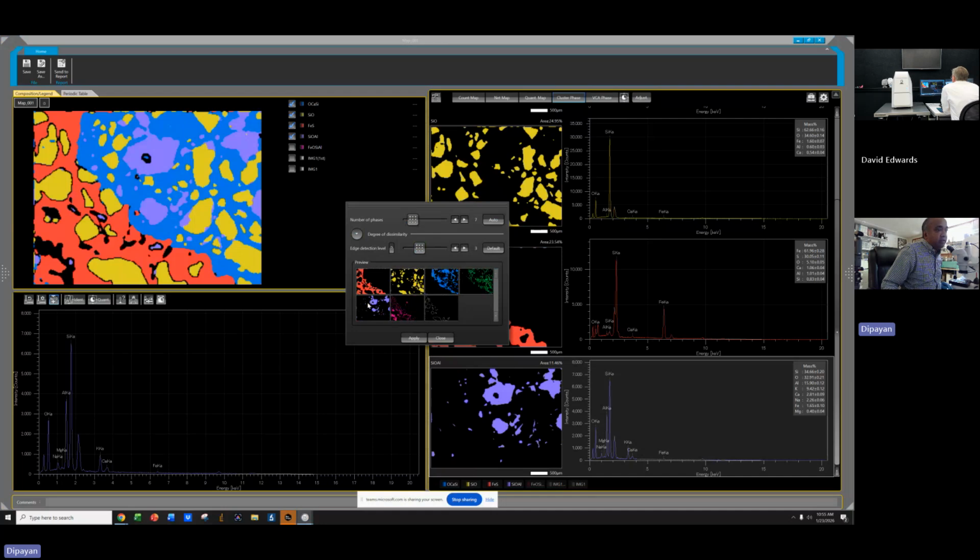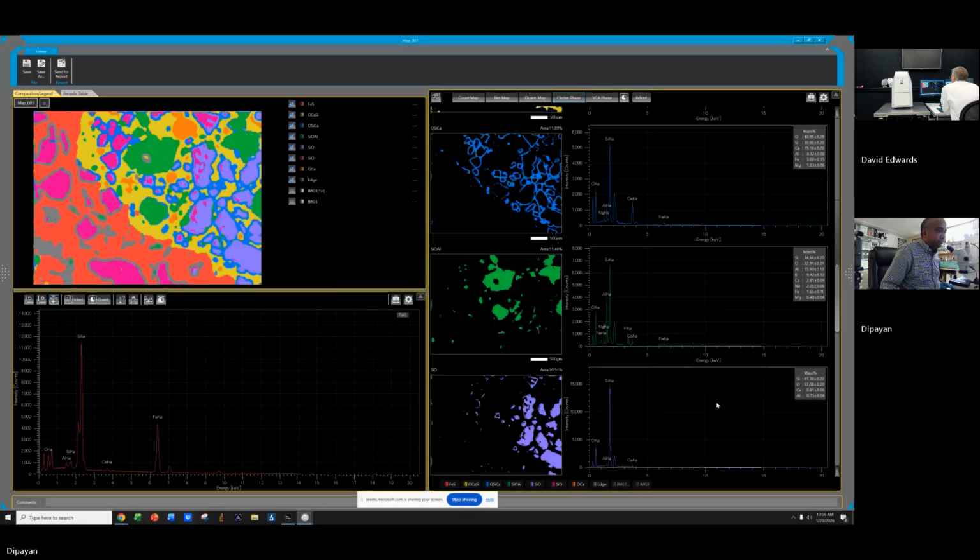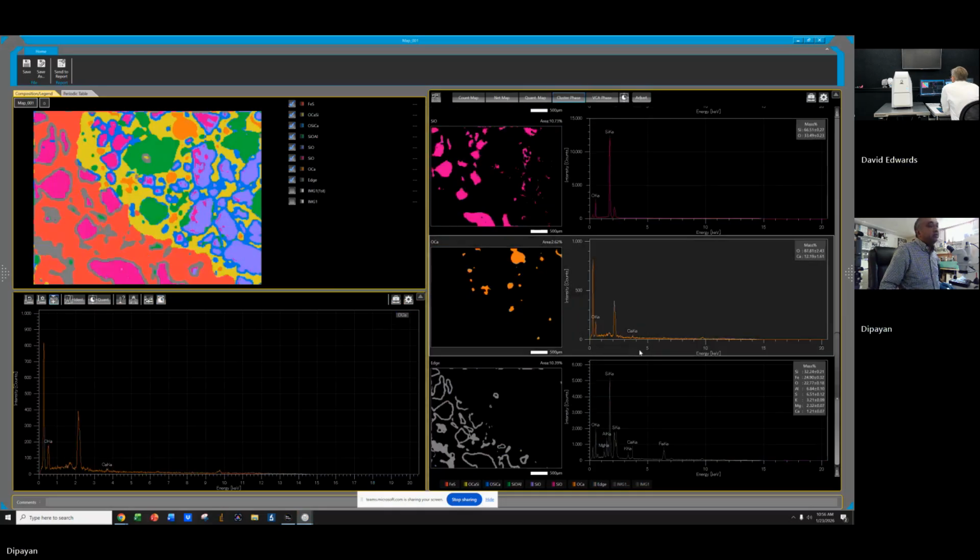But this one I can see, if I can split it, I would be able to see the splitting happening here. I don't need to apply until I see. Yep. Is it doing it? Like, for example, let's do this. It started creating some new phase. Yep. Right there. Oh, these are voids. Where you see the epoxy went into and gave you the carbon peak. So epoxy really helps me to identify what the voids are. So I can keep the voids.